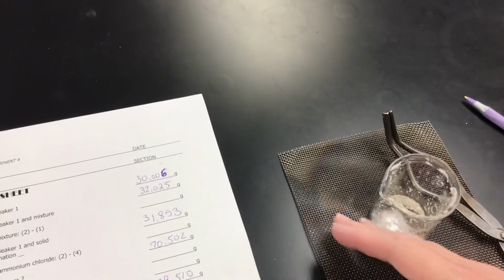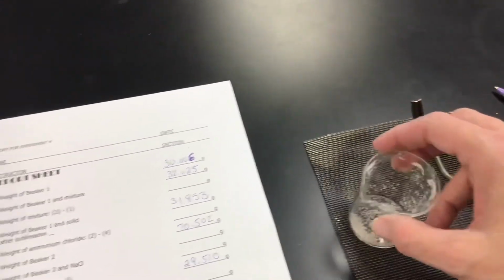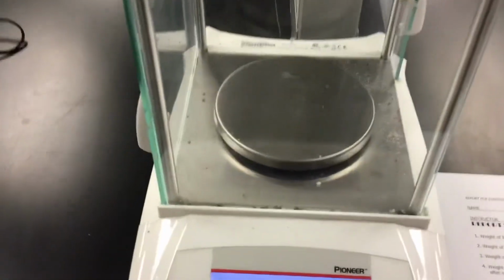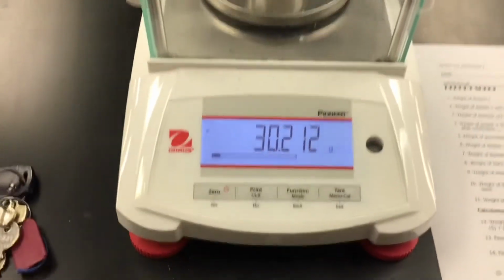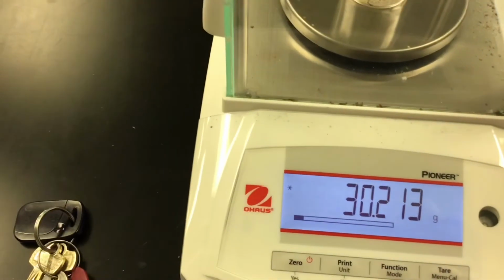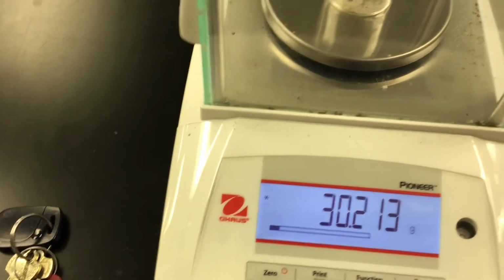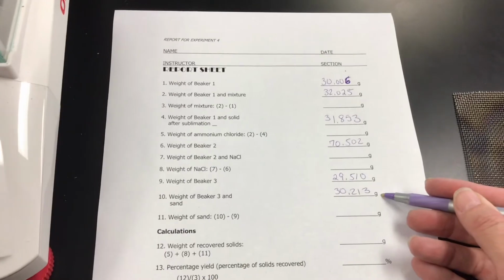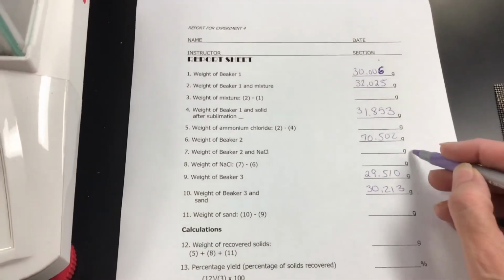Alright, so this one is completely cool. You can see how that sand just flows. So we're going to go over to the balance here, and it's 0 and it's tared out. So we're going to put that right on there, close the door. Okay, and then we know that the weight of beaker 3 and sand is 30.213. So we put that right there on spot 10.